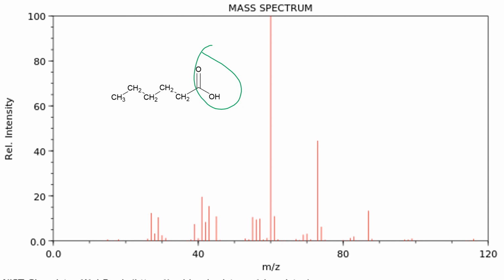So this fragment of a molecule right here consists of a carbon, an oxygen, a hydroxide, and that is it. So it's going to have a mass of a carbon, an oxygen, and a hydroxide all put together. So carbon is 12, oxygen is 16, so 32 plus 12 is 44, plus 1 is 45, so we'd expect to see a peak at around 45, which I believe is going to be that peak right there.